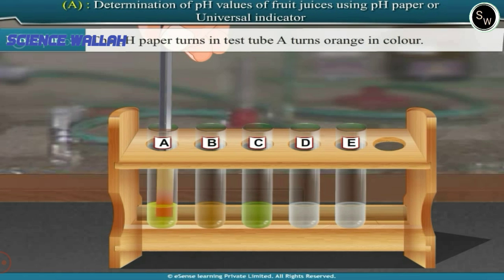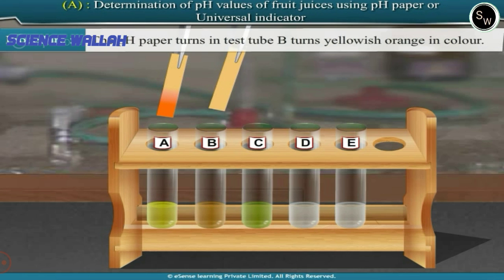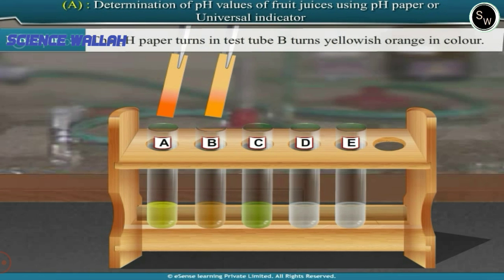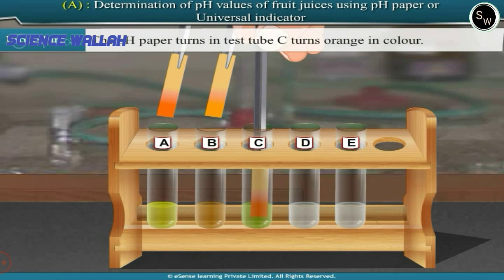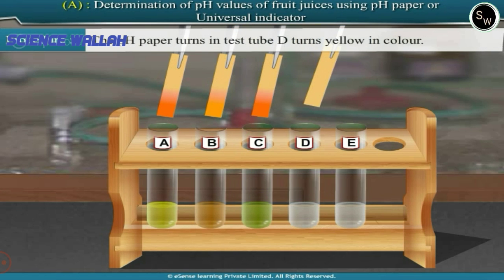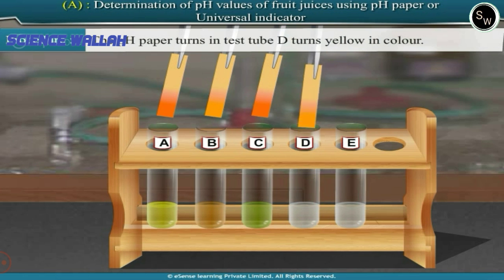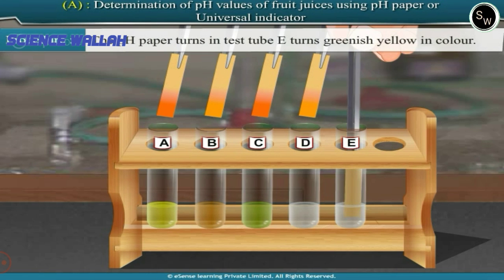What do you observe? The pH paper in test tube A turns orange in color. The pH paper in test tube B turns yellowish orange in color. The pH paper in test tube C turns orange in color. The pH paper in test tube D turns yellow in color. The pH paper in test tube E turns greenish yellow in color.